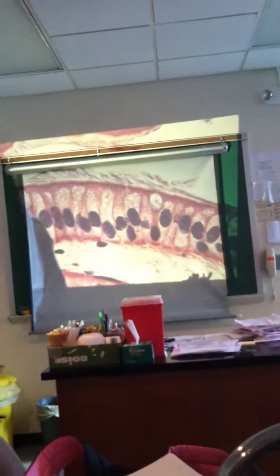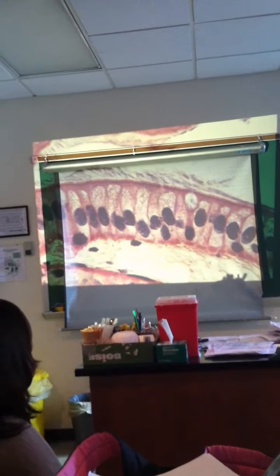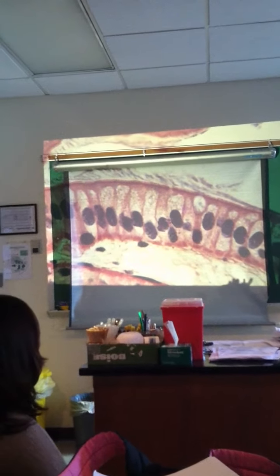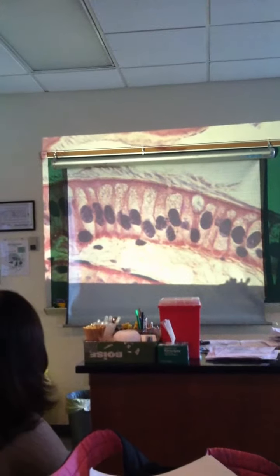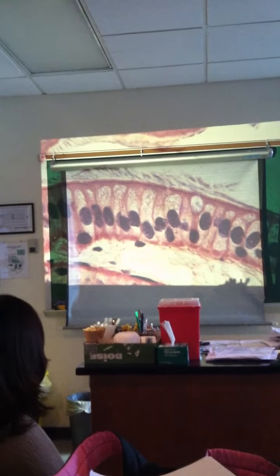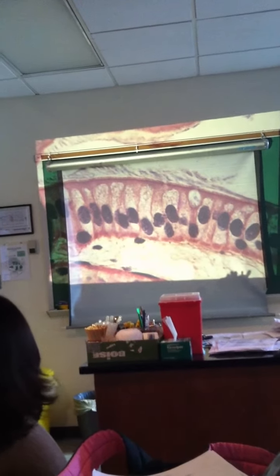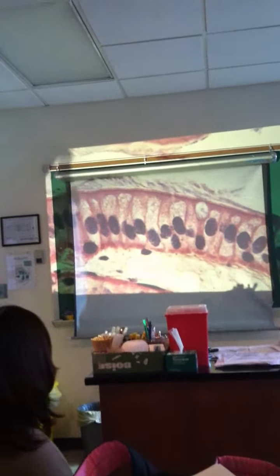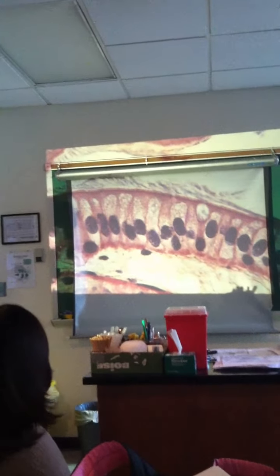So you had a really good slide in here that day. If you read the love notes as you went around, it said the pointer was pointing at some microvilli, but we told you we'd only make you know them up here. And I won't test you off of this. I just want you to realize they're there. A student that wants to see every little thing will now go back and look at that and notice, yeah, you sort of can see them, but they're very subtle.